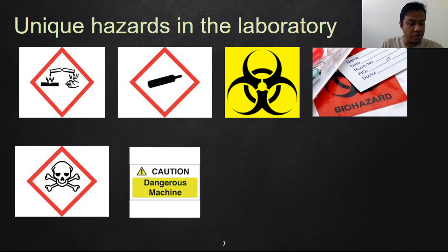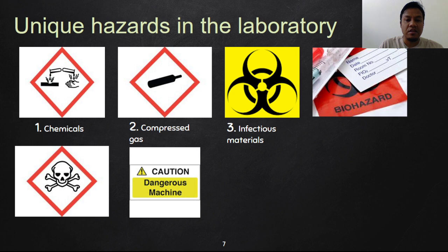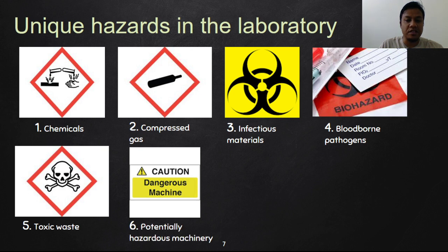And of course, there are special problems faced by the lab, which include chemicals, compressed gas, infectious materials, which is of course very unique to us, bloodborne pathogens, toxic waste, and potentially hazardous machinery.